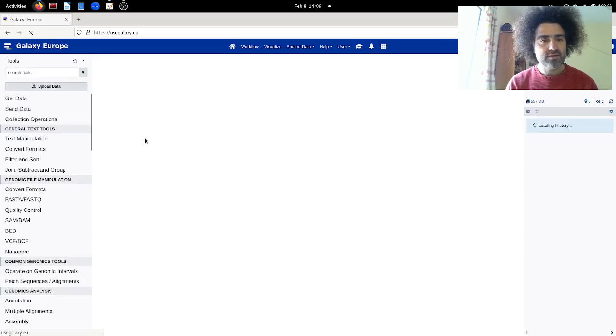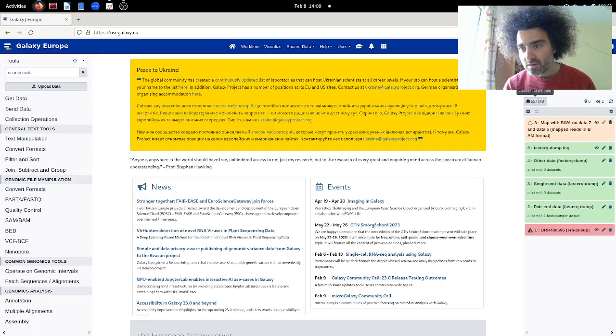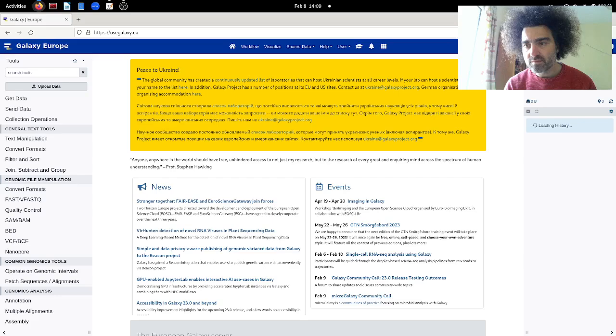Now Galaxy, let's wait for a while until it loads all the information. Let me make a new history here.